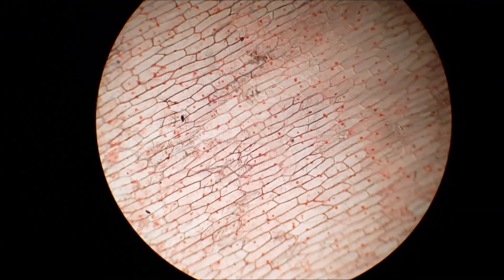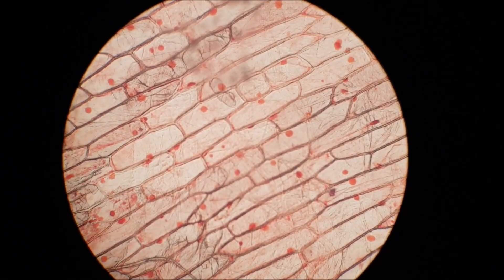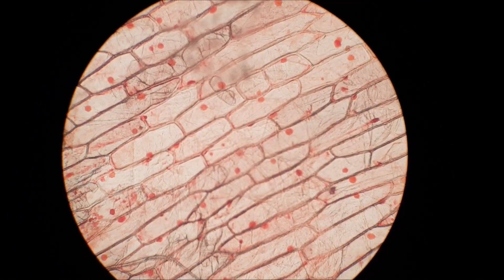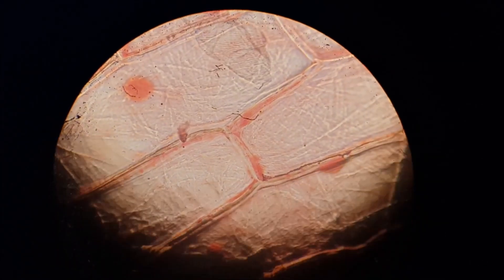In this video I explain everything you need to know to be able to install and work with the microscope. In order to see as much of your specimen as possible, it is important that you adjust the microscope as good as possible.